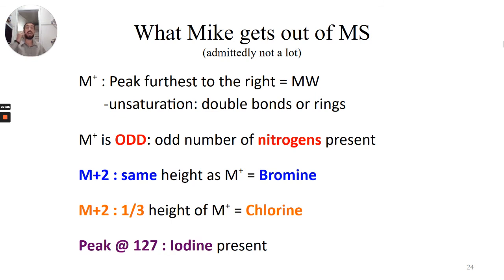So, mass spec. Really what I want you to get out of this is, we exploded a bunch of stuff, we get pieces. Okay? There are 5 big things, and we'll sort of call it 6, and we'll look at the 6th in a second, that you should really nail down right away. These first 5 are the big ones.